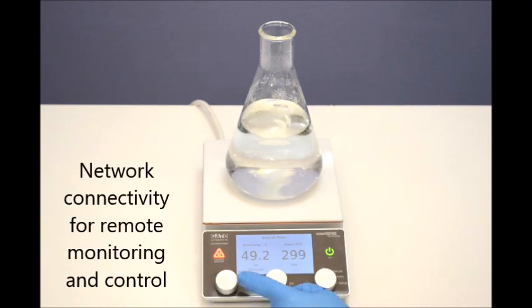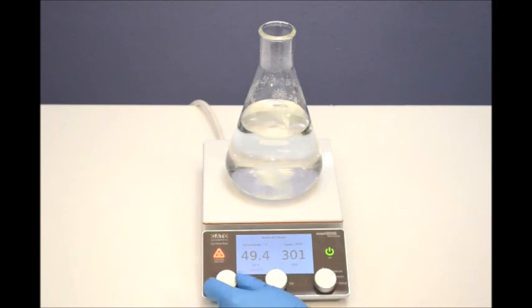This level of control has only previously been possible with wired probes that were error prone and cumbersome to set up.